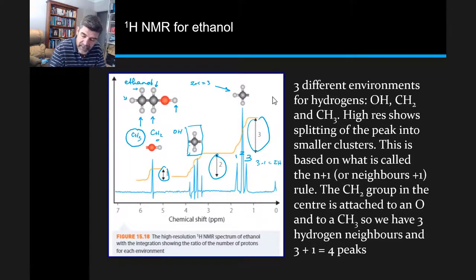So there are three hydrogens attached here, and therefore with our n plus one rule, three plus one is four. Then we have in this region here, four of these little peaks.